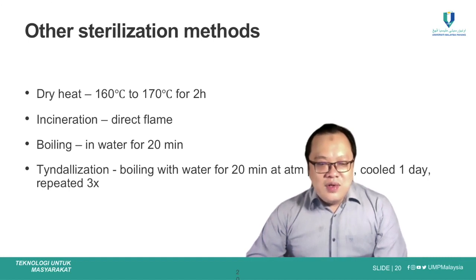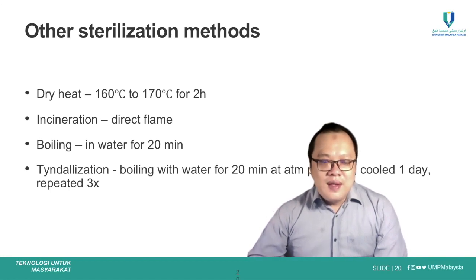And you can also use tyndalization, that is the boiling in water for 20 minutes at atmospheric pressure, and then cool for 1 day and repeat 3 times. This is more effective than boiling the media for 20 minutes.